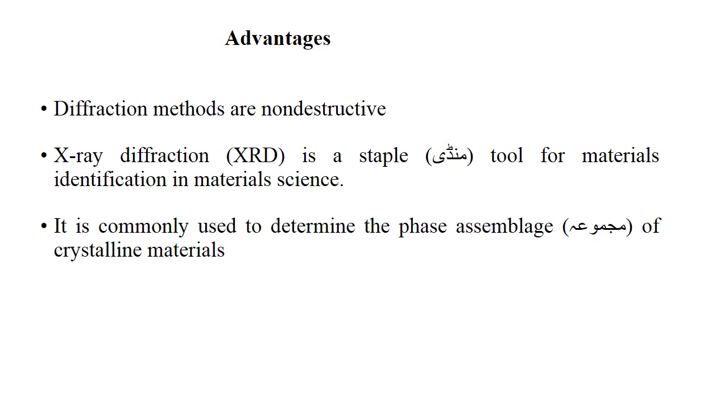For example, for silica, SiO2, a number of polymorphs exist including quartz, cristobalite, and tridymite, with XRD being able to distinguish their presence based on the differing crystal structures, despite their common chemical composition.